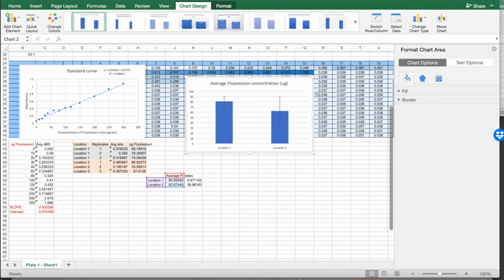So all you have to do is divide by the, I don't remember how many grams, 1 gram. We used, I don't remember if it was 1 gram or 2 grams. So you can divide by the amount of grams you used in this lab experiment, so you express it per gram of soil. Whichever way you choose to do, it will be fine. I think this way is fine.